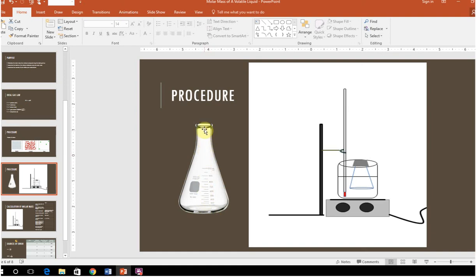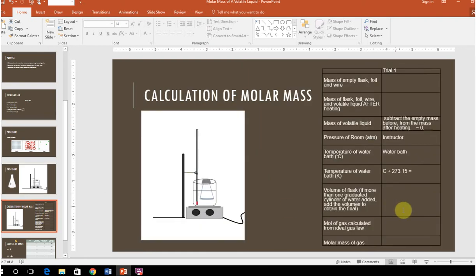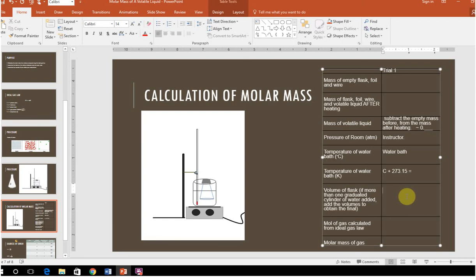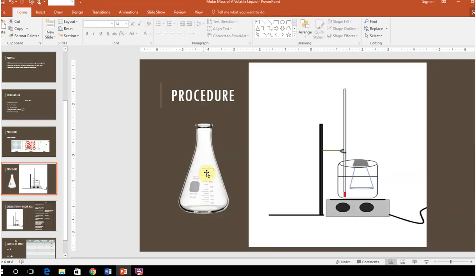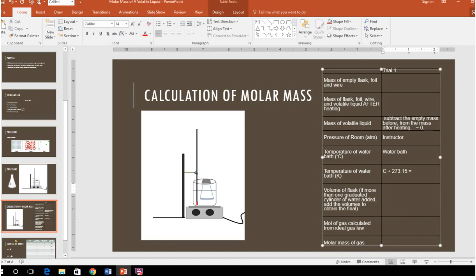So what you guys are going to do to really make sure you know the volume of this flask is you're going to fill it all the way with water, all the way to the top, because that's how much the vapor would occupy. And this is only once everything else is done. And you're going to pour that water into a graduated cylinder. Now, you get a 100 ml graduated cylinder. This is a 125 ml flask. So you're going to have to do it more than once.